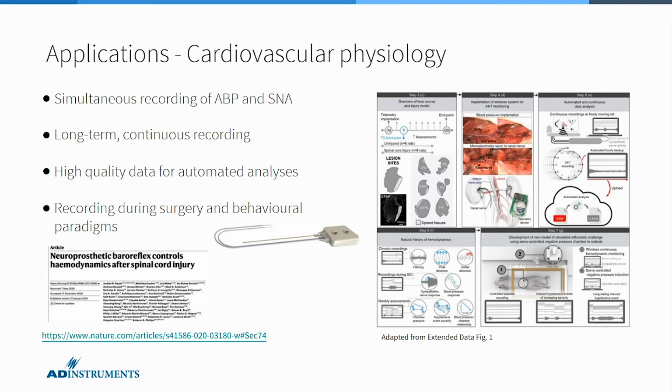And this is a really, really nice paper. Even besides the telemetry, I'd really recommend that you go away and read it because it's a really interesting study. But it really highlights the power of the telemetry system too. So they were recording over a really long period of time, up to 42 days after their spinal cord injury. And they were recording continuous data as well, 24 hours a day, 7 days a week.